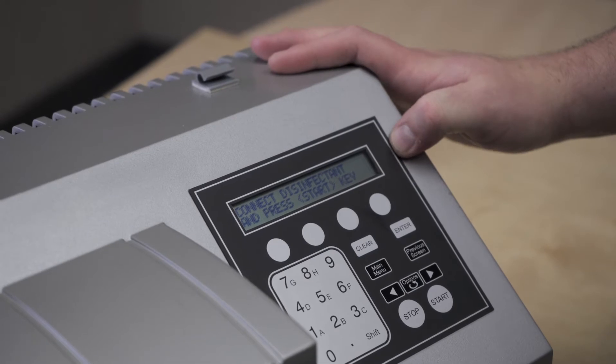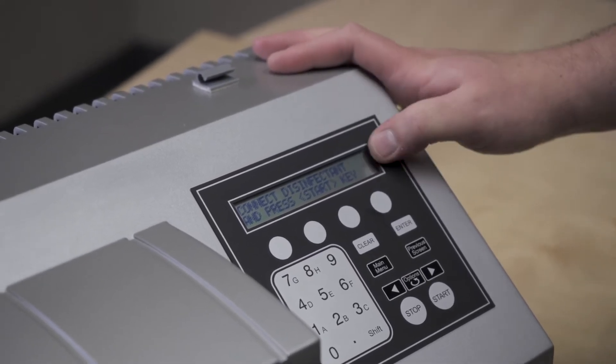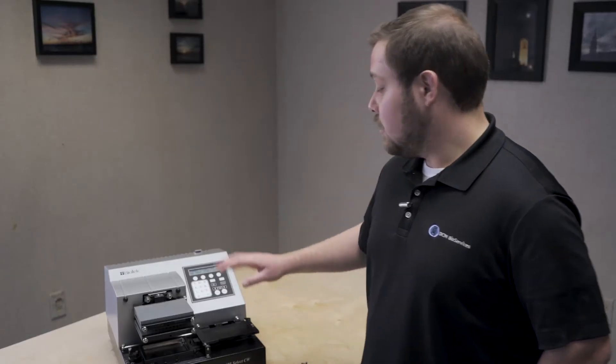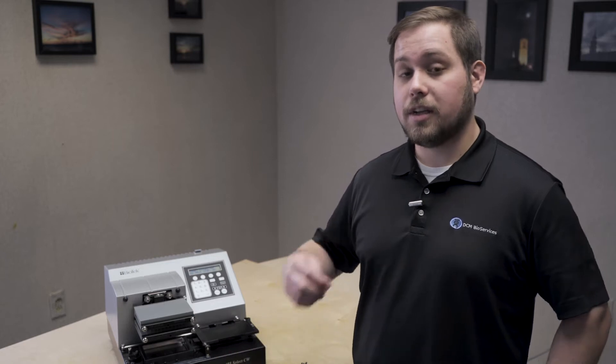If we had a valve module installed, it would prompt us to define which valve had the disinfectant, which had the water, and which had the air. This protocol will prompt you, based on your setup for your biotech, to connect a disinfectant buffer bottle, a water buffer bottle, and an empty air buffer bottle.